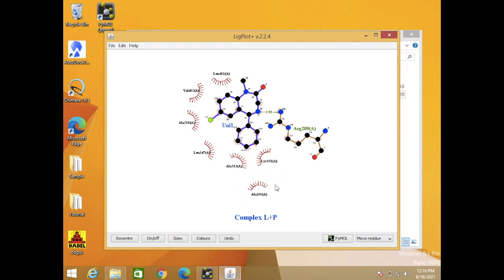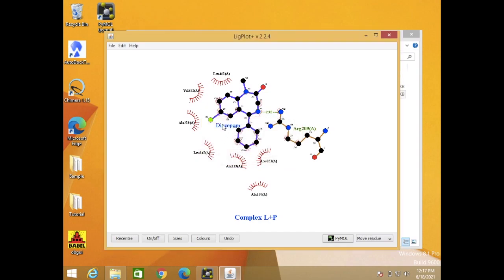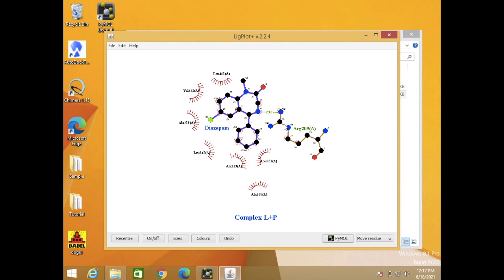This is a 2D diagram of ligand-protein interaction. This is my ligand. The ligand is diazepam. This amino acid, which is arginine 209, interacts with my ligand via the hydrogen bond. This is the bond length or the distance between them, which is 2.95.